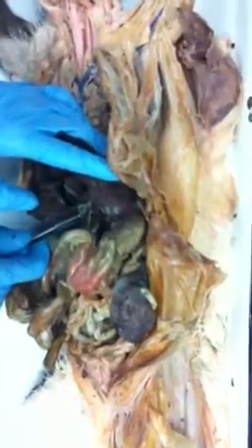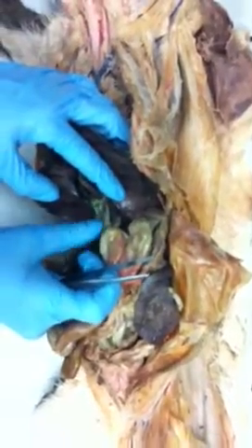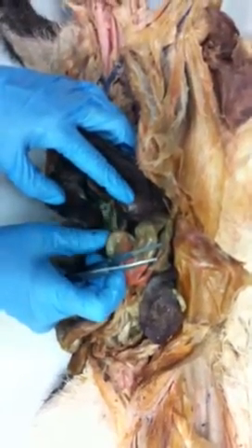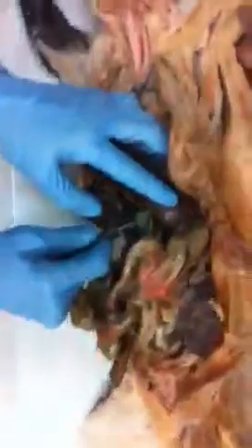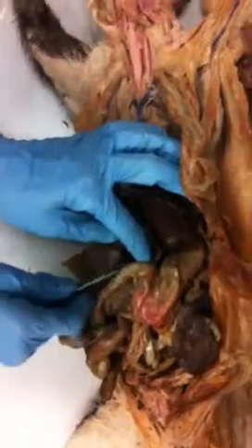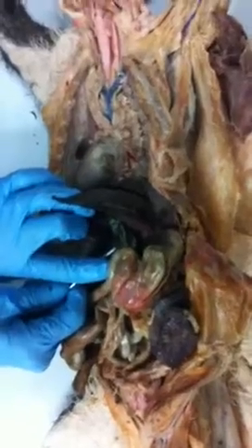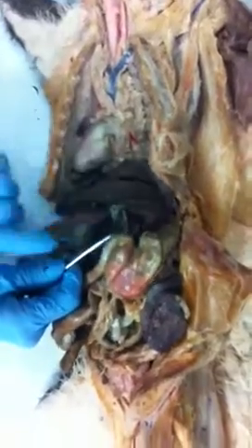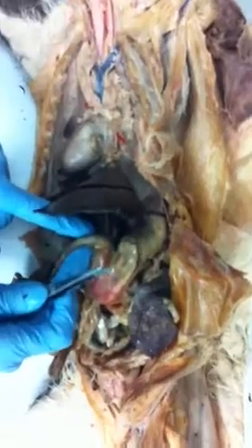And in here somewhere, in with all this fascia, see that green line coming down? That's full of bile. That's the bile duct, or the cystic duct. Okay? So cystic duct coming out of there, carrying the bile. You also have ducts coming in over here from the liver itself. Those are hepatic ducts. Those actually all combine into one big tube, one big brownish greenish tube right here. That's the common bile duct. So that's going to carry secretions directly from the liver and the bile coming from the gallbladder. Okay? And it delivers it again right to the beginning of the duodenum so that we can break up that fat.